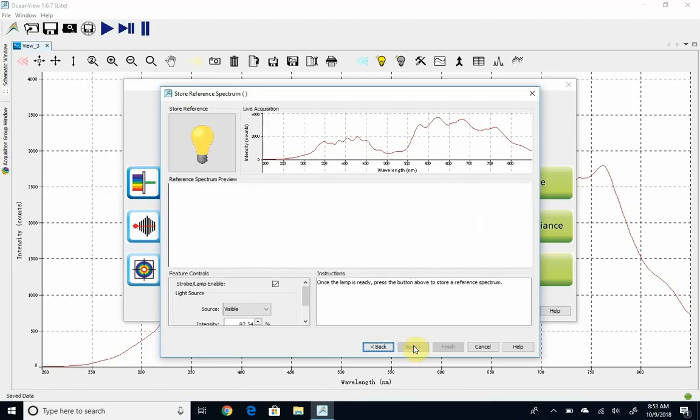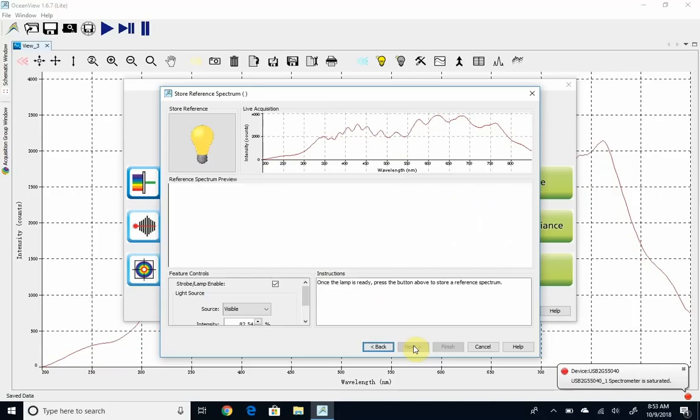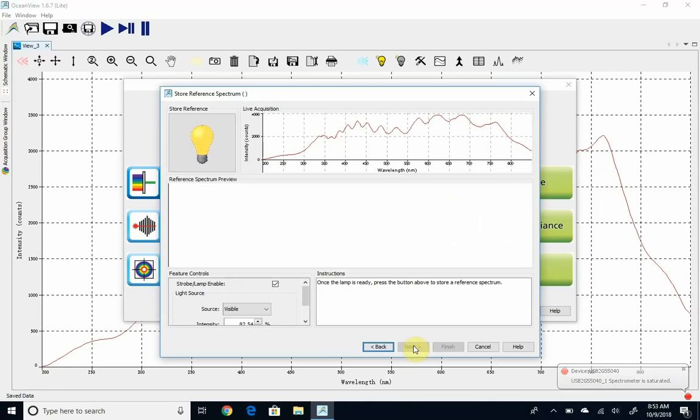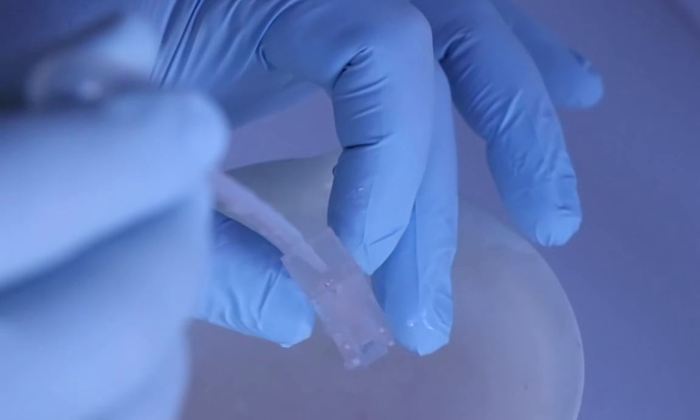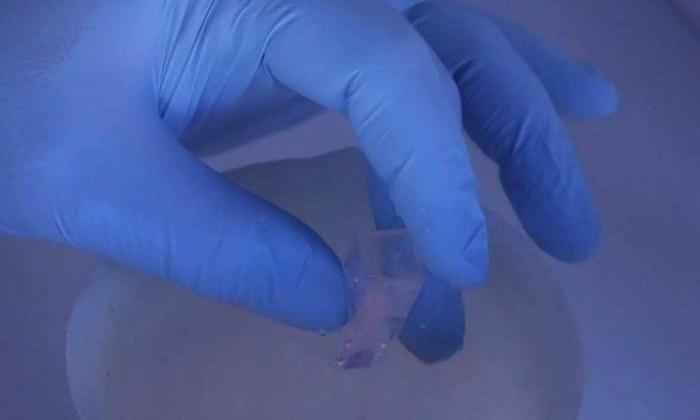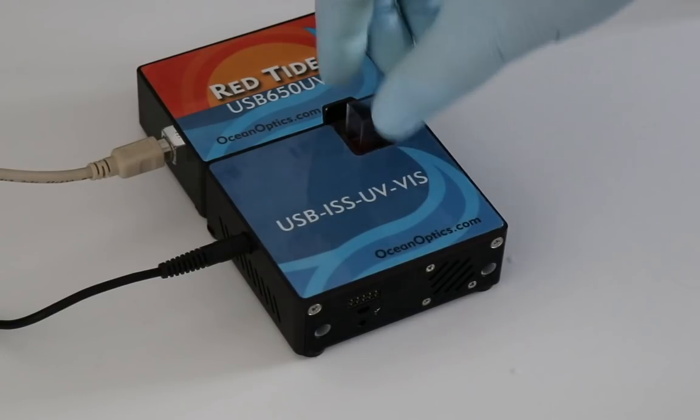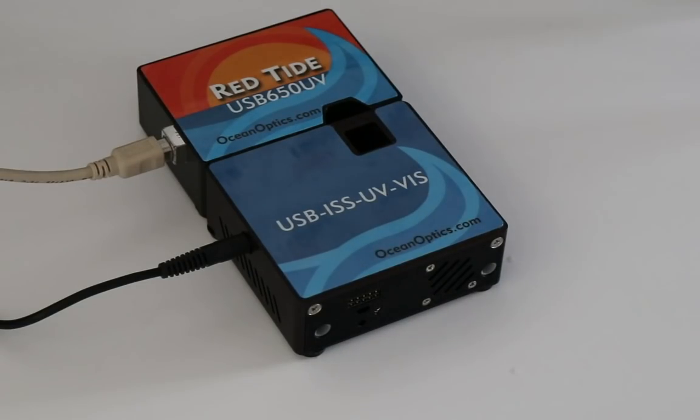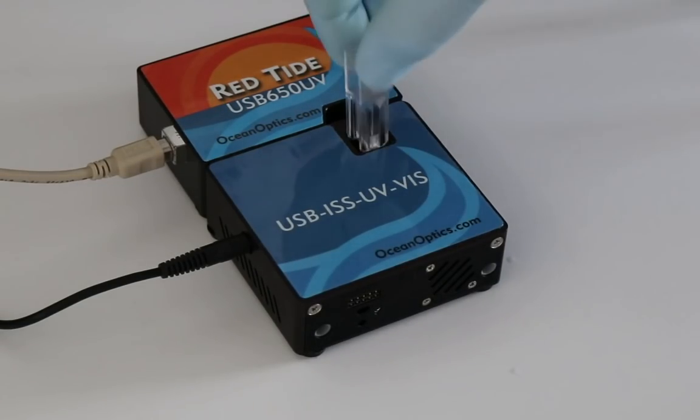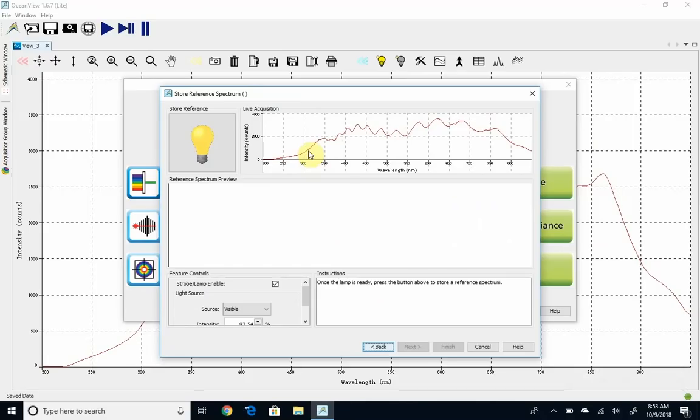The next thing is to store a reference spectrum. When our sample was in there, some of our sample absorbed light. Now, when I put the reference spectrum in, I'm going to use just plain water. In the live acquisition window, you should see something like this. I want you to notice very little light makes it to the detector below 300 nanometers. That's going to give us a lot of noise later on.